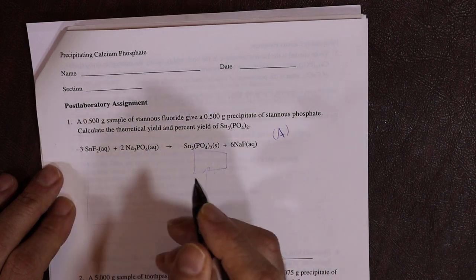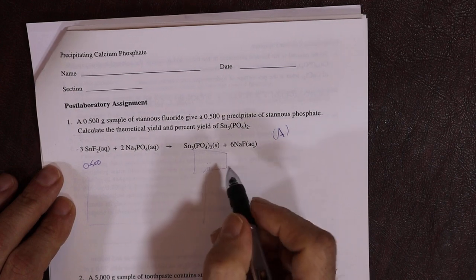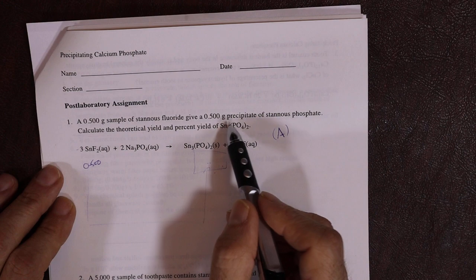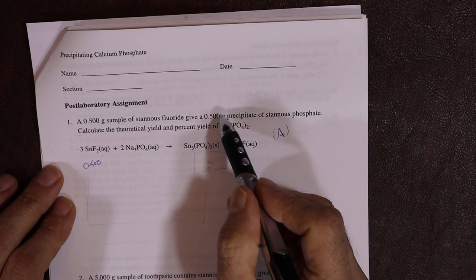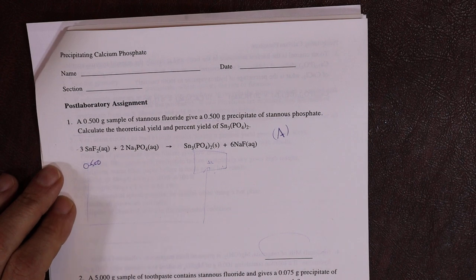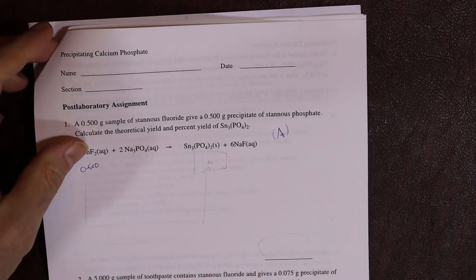So this is going to be 0.5 here. Work out this number and then compare it as a fraction, a mass percent, to this number. The 0.5 precipitate is not what should be in there. We're going to work out what it should be, and then that's what it actually is out of the oven. And then work out the percent yield. Usually it's going to be pretty high, probably in the 90s. When we do these things in industry, they're usually pretty high percentages. Okay, next one.